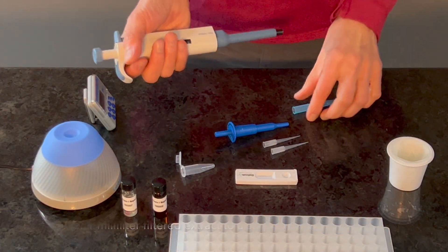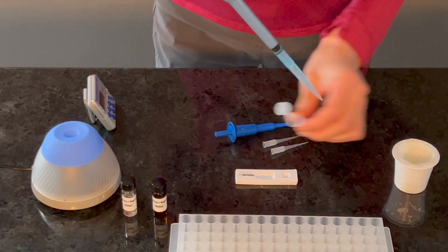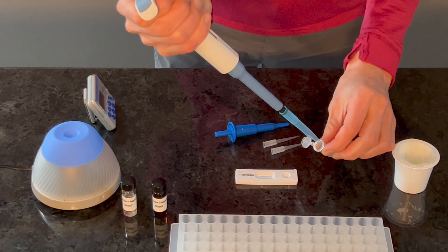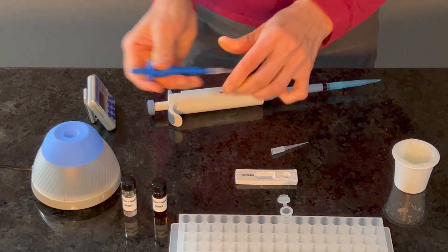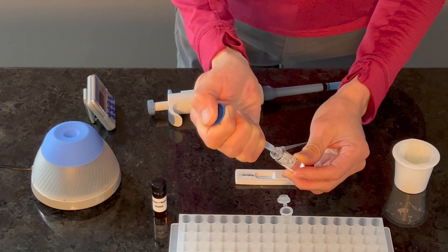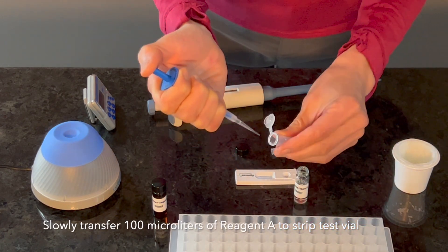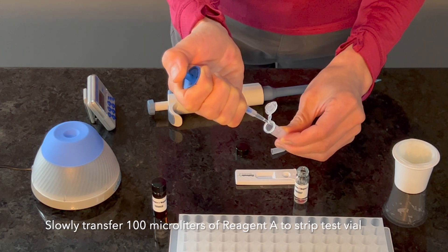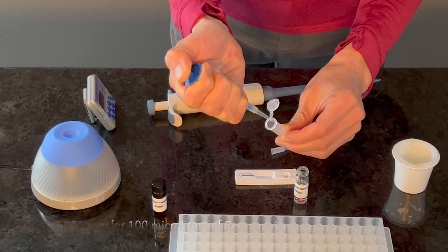Pipette 1 milliliter of filtered extract into a strip test vial, then add Reagent A to the same strip test vial containing the filtered sample. Reagent A is viscous, so pre-wetting the pipette tip is recommended with a slow and consistent delivery to ensure complete delivery of the reagent.